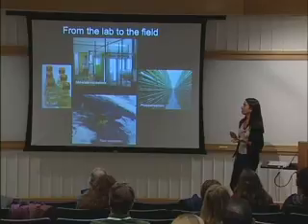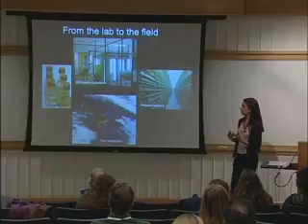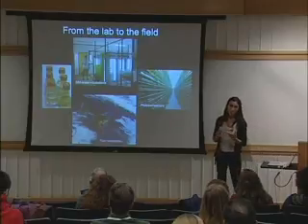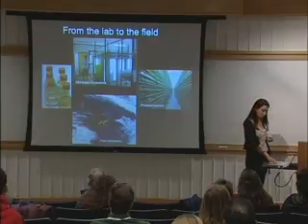One of the harvesting that we do is for proteomics. We try to harvest protein from our vessels and look at what changes under different conditions, in different pCO2 conditions.